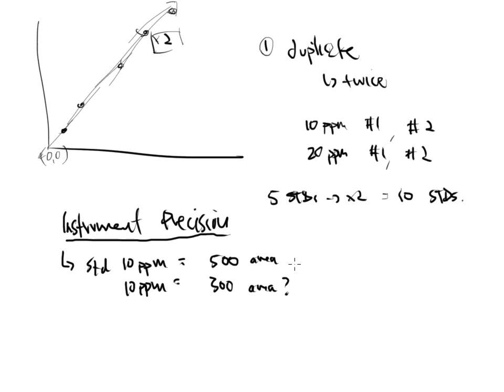Did the instrument have a fluke? Did the instrument just make a mistake, right? You've got to think there's all kinds of electronic pieces inside of these instruments that allow them to do their job. Well, what if one of those valves, what if one of those pumps, what if one of those detectors that it's using to measure how much stuff is present malfunctions or has a glitch? These things can happen, right?